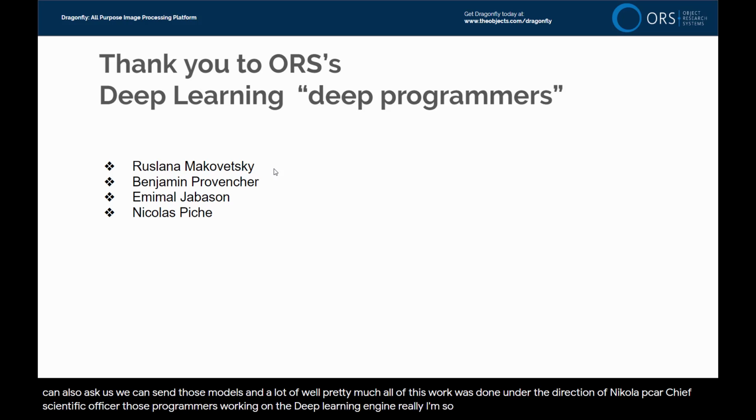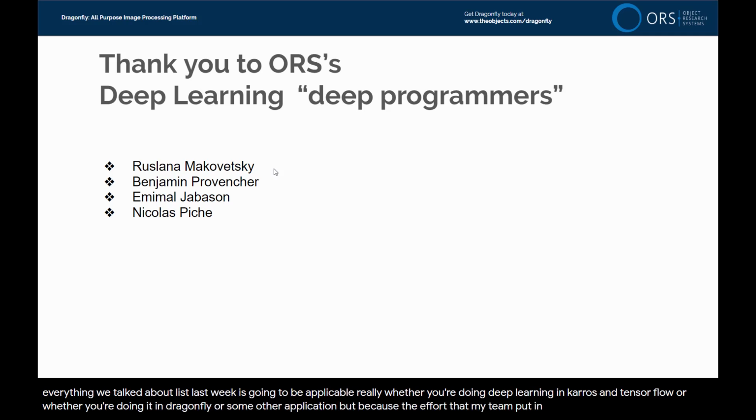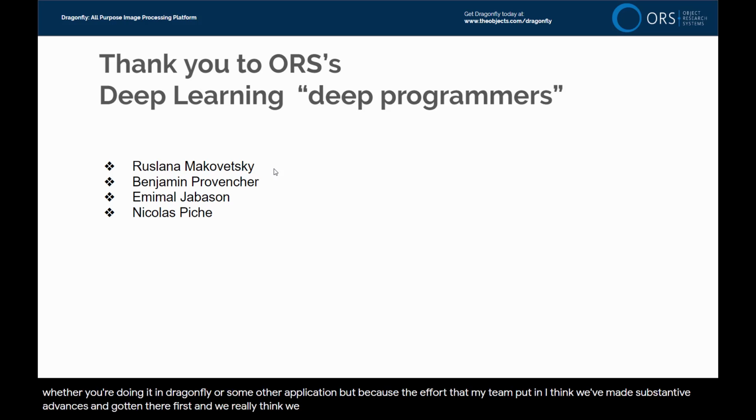Really, I'm so happy with the deep learning engine in Dragonfly. Everything we talked about last week is going to be applicable, really, whether you're doing deep learning in Keras and TensorFlow, or whether you're doing it in Dragonfly or some other application. But because of the effort that my team put in, I think we've made substantive advances and gotten there first, and we really think you're going to see the deep learning capabilities that you have in Dragonfly are going to give you an edge over other tools. So we encourage you to use it, and we thank you for your support.